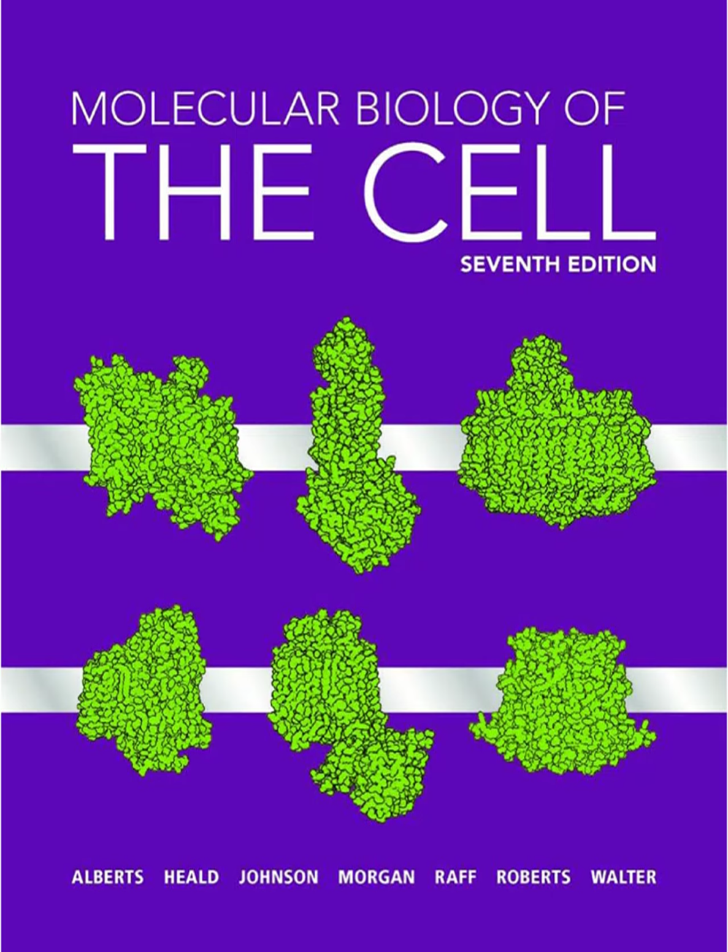That's genius. Effective super resolution without the fancy microscope. You got it. You can get down to maybe 25 nanometer effective resolution. It's great for things like mapping RNA transcripts or tracing fine neuronal processes. And you can combine it with other techniques. Okay, what about imaging really big things, like whole embryos developing over time or large chunks of brain tissue? Standard confocal or multiphoton might be too slow or cause too much photo damage for long-term imaging. That's where light sheet microscopy, also called SPIM, selective plane illumination microscopy, has made a huge impact.